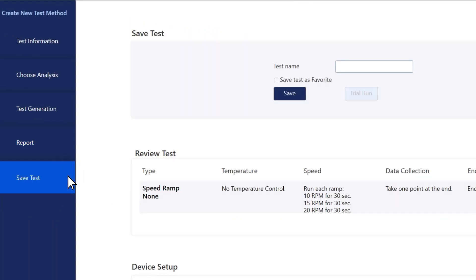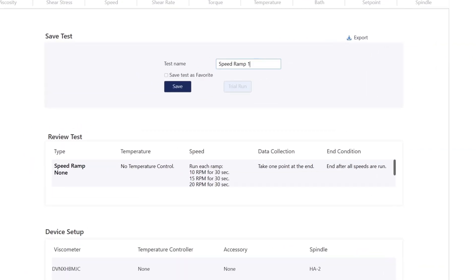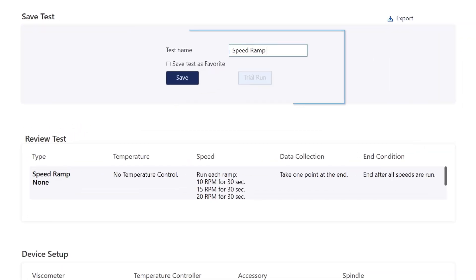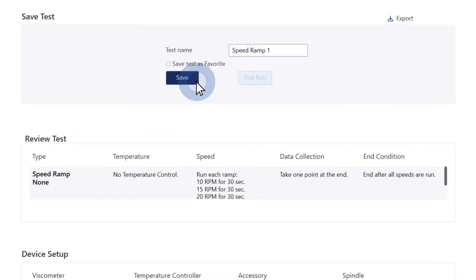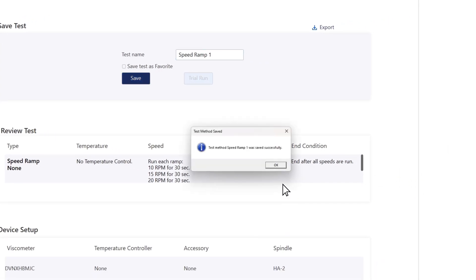Now we're in the reporting section. Here you can customize each section of the report and what is included. And this is the save test section. Here you can review your test and once you've confirmed everything is correct, hit save. The test is saved correctly.